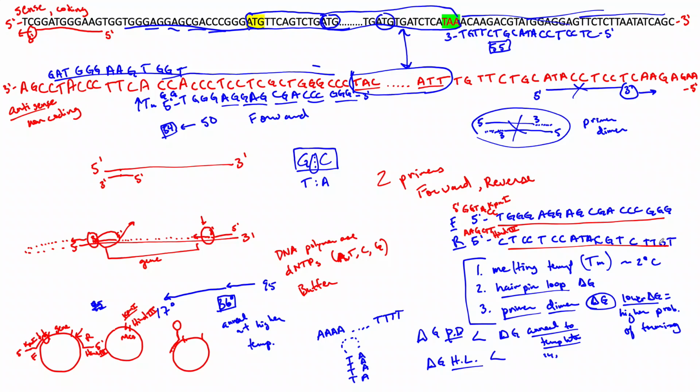Now, this would be almost perfect, but having a cut site on the very end of the primer reduces the efficiency of the enzymes once you actually cut the DNA. So on the very 5' end, I'm just going to add a couple of A's to put that cut site a little bit inside the primer.